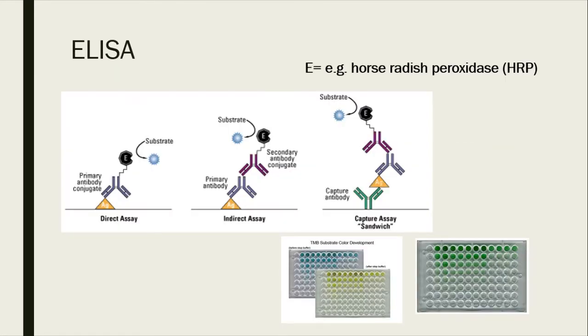All right, so ELISA, graphically, how it works. It is relatively simple when you compare it to flow cytometry. If you understand flow cytometry, ELISA shouldn't be too bad. Now, enzyme-linked, so there's a link. Another key component here is some type of enzyme. Usually we use horseradish peroxidase. It is an oxidase isolated from horseradish, the plant that you could put into salad if you like, but it's a little bit pungent in my opinion. So this enzyme can catalyze a substrate and generate a color.